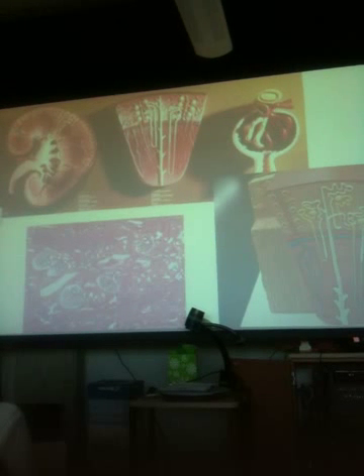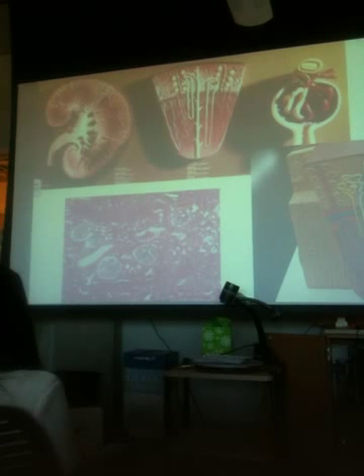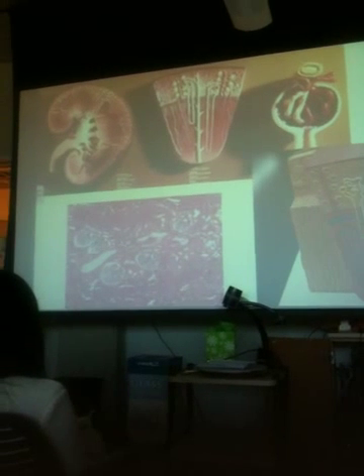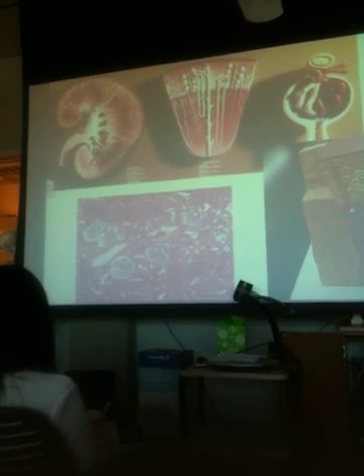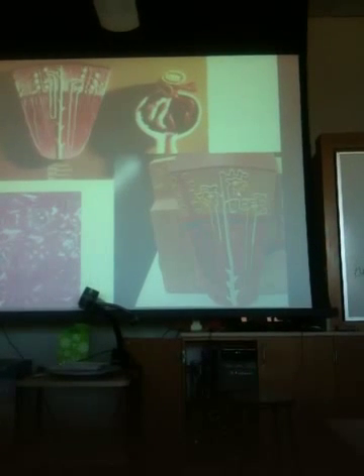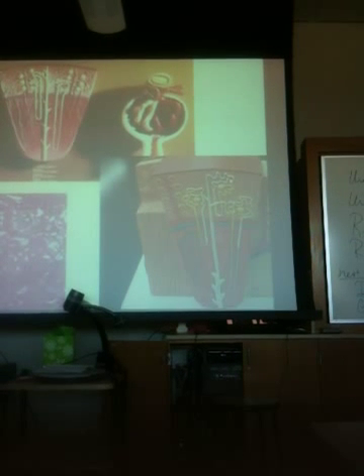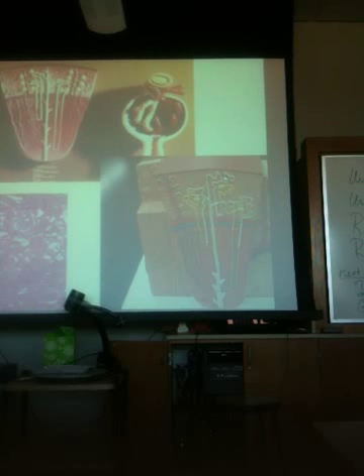Okay, so here's a histology shot of kidney. What are these guys? Glomeruli, and you can see the Bowman's capsule space around it. Let's see, what is the yellow tubule over here? Is it proximal? PCT. White tubule? DCT.